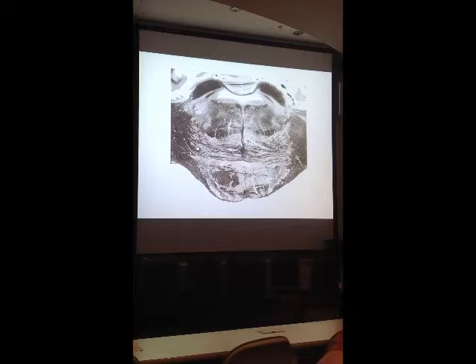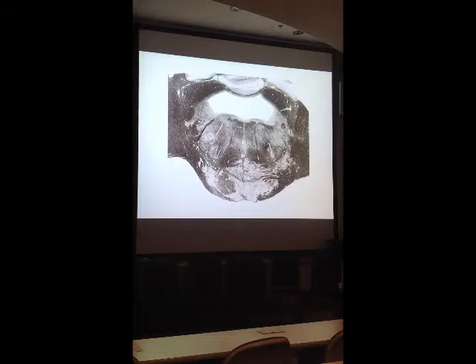Okay. Again, it's pons, so we talked about this earlier in the course, that some of the major somatosensory pathways carrying information from the body ascending through the pons form that whale-like structure through here, this white matter area. The head and body of the whale is the medial lemniscus. The base of the tail of the whale is the spinothalamic tract. And the trigeminothalamic tract, which is carrying information from the face, is along the back of the big body of the whale through here. So in any event, this is an upper section through the upper pons, and there are several structures there.